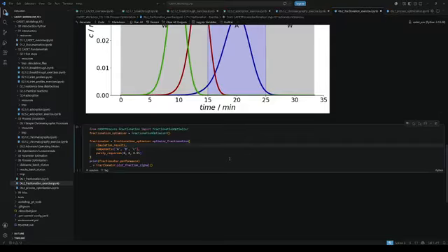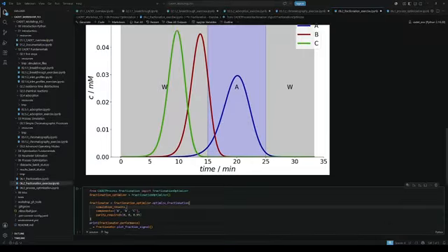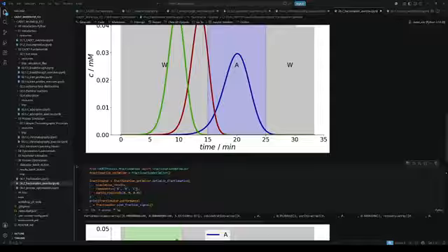So next, those were manually chosen points at which we would fractionate, but now we want to optimize this. And now we can use the functions available in CADET. And by setting it up like this, we tell the system, okay, please give us the fractionation time so that we achieve a 95% purity in our fractionation for C in this case, right?